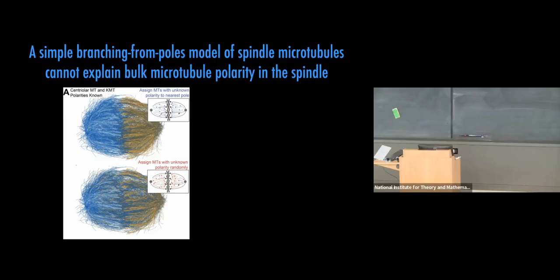This would be the minus end closest to the pole and the plus end here. And you can do this for all microtubules, maybe thinking a little bit like augment, right? You have a microtubule, another one coming off. So they should all have polarity determined by the nearest pole. Or alternatively, maybe it's random, right? You just assign random polarity to all those microtubules.